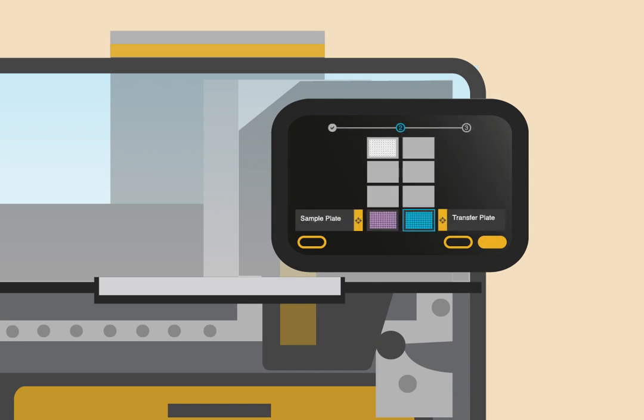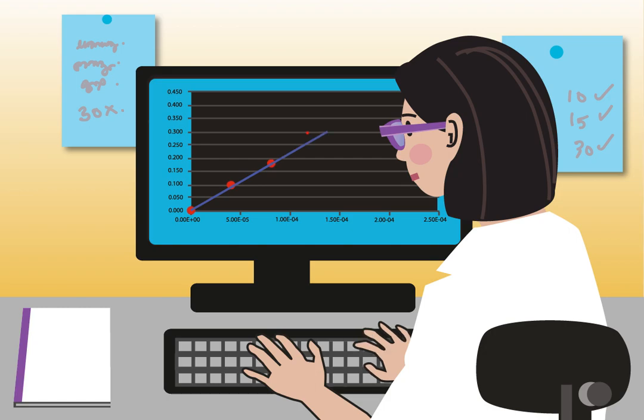The Prep software is clean and intuitive. In mere minutes, Michelle can program and run her protocol and focus on high-value work.